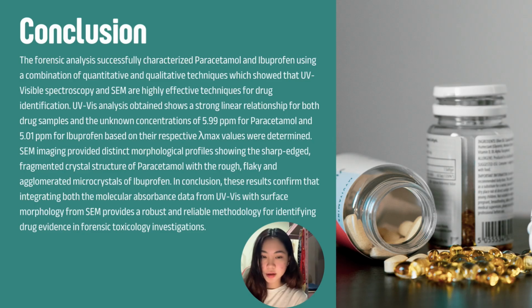The SEM imaging provided distinct morphological profiles, showing the sharp-edged fragmented crystal structures of paracetamol and the rough, flaky, agglomerated microcrystals of ibuprofen. In conclusion, these results confirm that integrating the molecular absorbance data from UV-Vis spectroscopy with surface morphology from SEM provides a robust and reliable methodology for identifying drug evidence in forensic toxicology investigation.